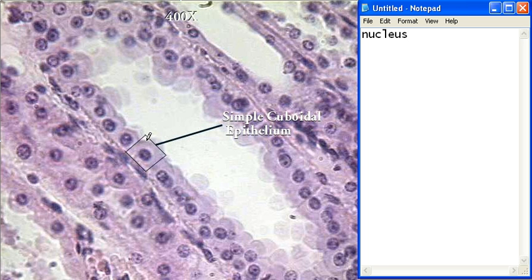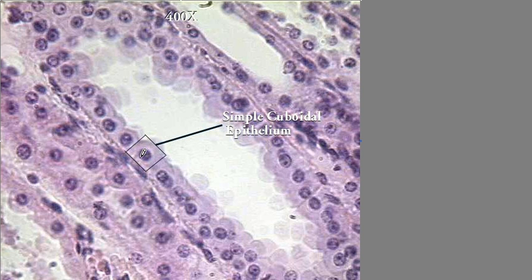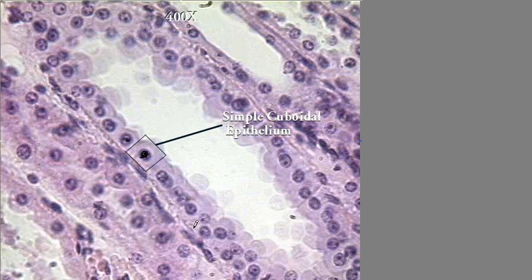The main structure you will need to know is the nucleus, which is basically this dark dot right here. As you can see, there are many of them, kind of like simple squamous epithelium. Almost all tissues will have a lot of cells like these that you will be able to easily differentiate, because they are tissues composed of cells.